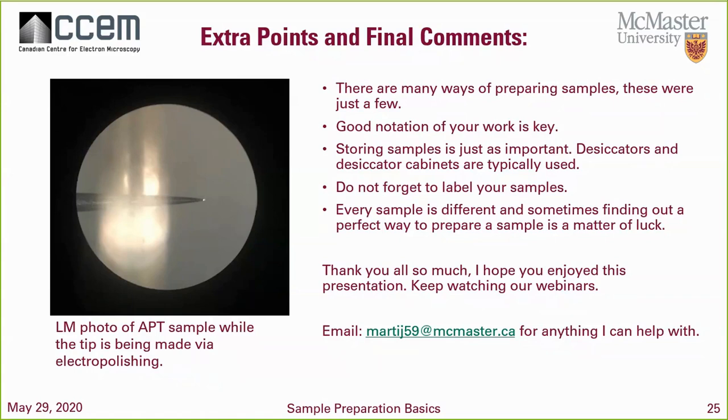Now, do not forget to label your samples as well. Something I should have mentioned earlier, extremely important, because worst case scenario is you're preparing a sample for a technician and you have 6 samples in there and you didn't label any of them. The technician is asking, where is everything? So make sure that you label very well.